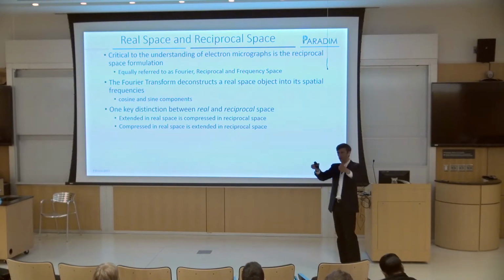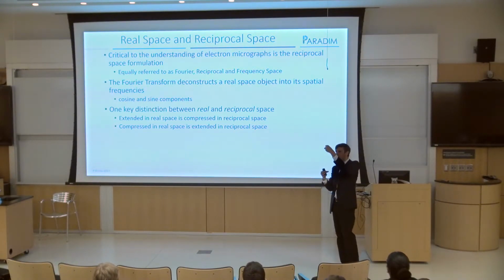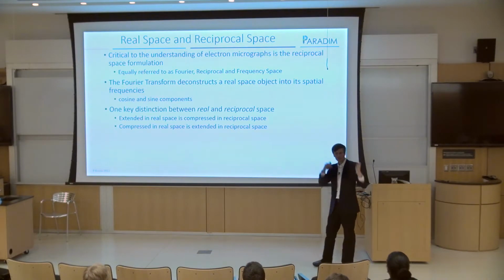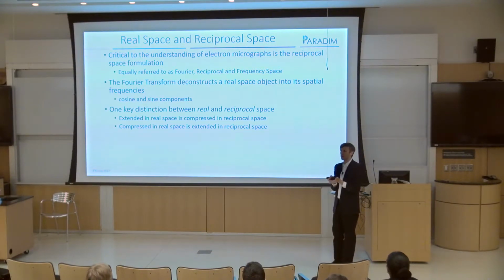In a TEM, you have a parallel beam of electrons, and your diffraction pattern has dots in it, right? In a STEM, you have a converged beam of electrons, and you get disks. So you're looking at a converged probe in STEM, and in your diffraction pattern you get disks, so it's something small becoming something extended, right? But it's the opposite in TEM. Something that's extended becomes very small. Just a nice concept to keep in your mind.